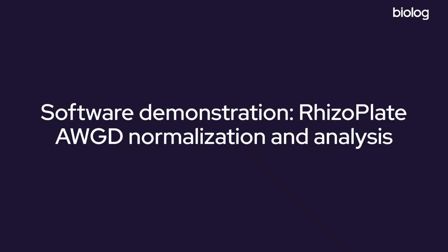Now that I've shown you how we can apply the rhizoplate average well growth development normalization and analysis, I want to get into the software to show you how to actually generate these curves.